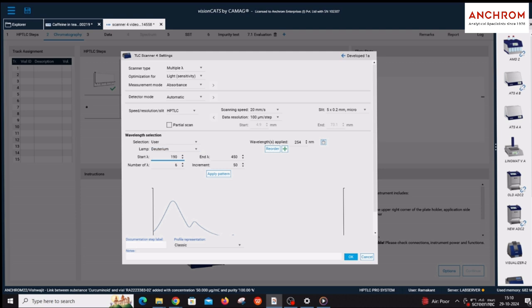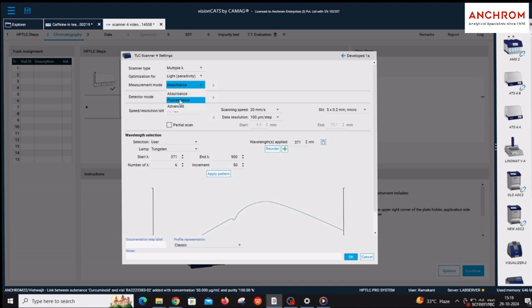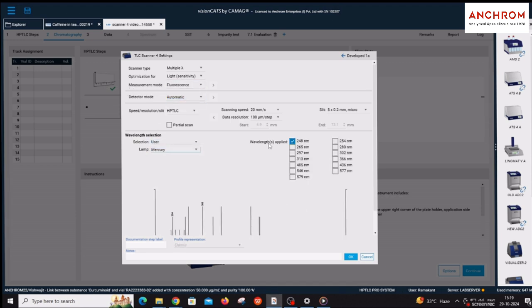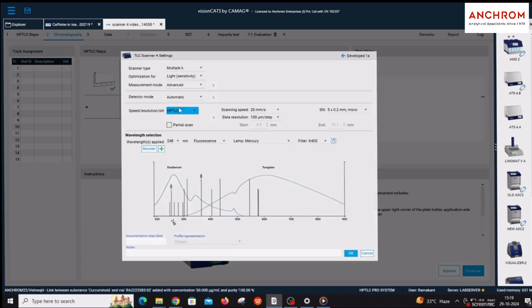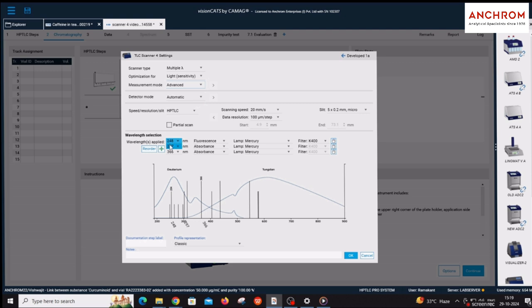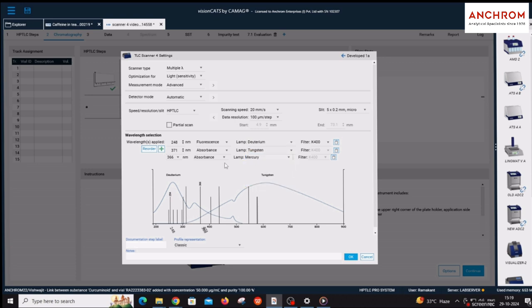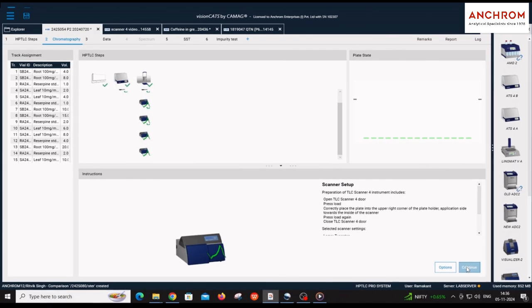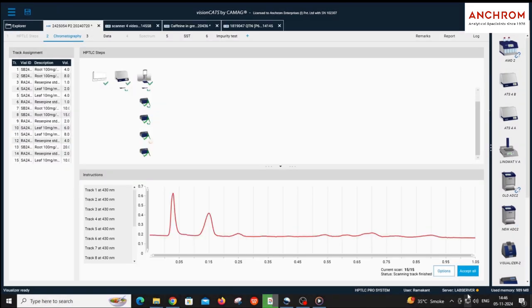For UV range, 190nm to 450nm, and visible range, 371nm to 900nm. By selecting fluorescence in the measurement mode, you can apply for scanning in multiple wavelengths from the fixed 13 wavelengths under fluorescence mode. By selecting advanced option in the measurement mode, you can apply for scanning in multiple wavelengths from UV range, visible range, and fluorescence specific wavelengths. Click continue to do scanning and click accept all.